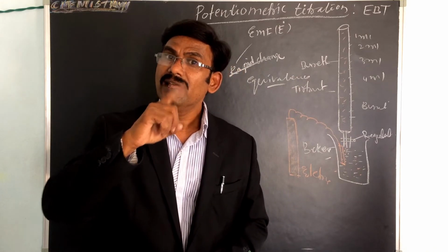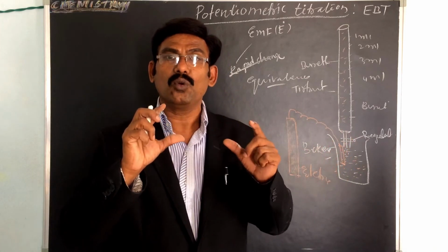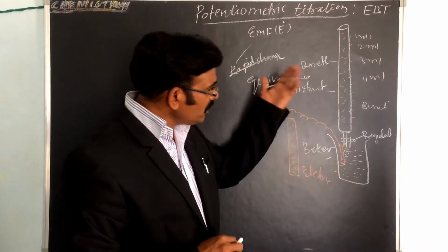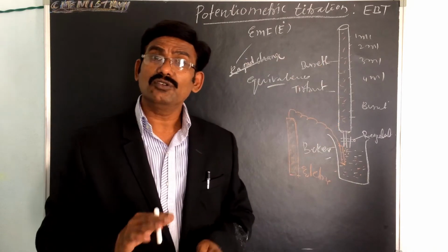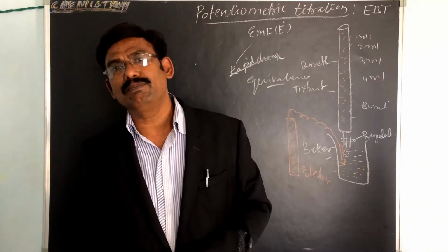At this stage, the addition of titrant is regulated. We have to control it. We have to regulate it, and the titration is continued after that. At a certain point the equivalence is reached, but don't stop the titration; continue even after the equivalence point.